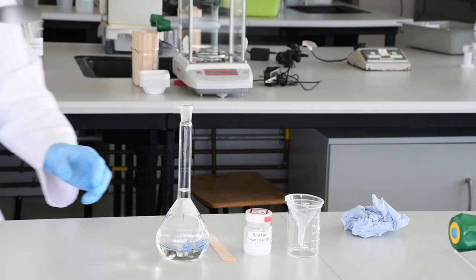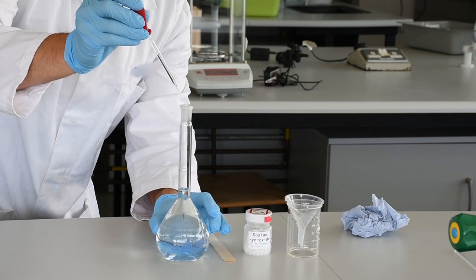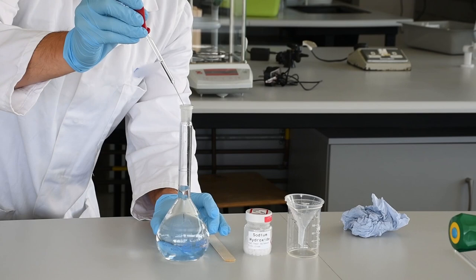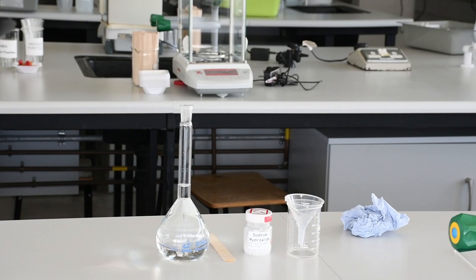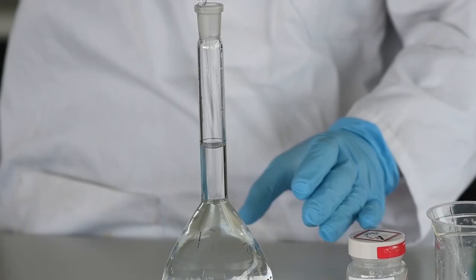When making measurements, you want to make sure there's no parallax, and we're using a Pasteur pipette so we can add the liquid drop by drop. You'll see on the volumetric flask that the marking goes all the way around the edge, and you'll know there's no parallax if you're looking on from the edge and you can't see the other side of it.